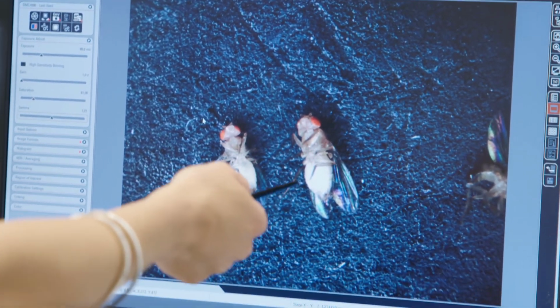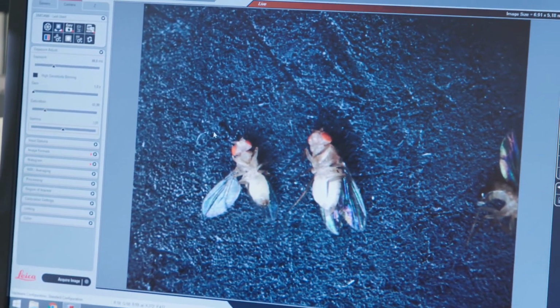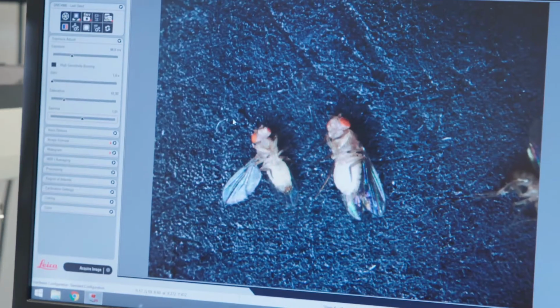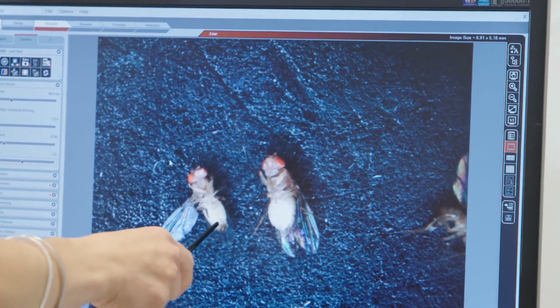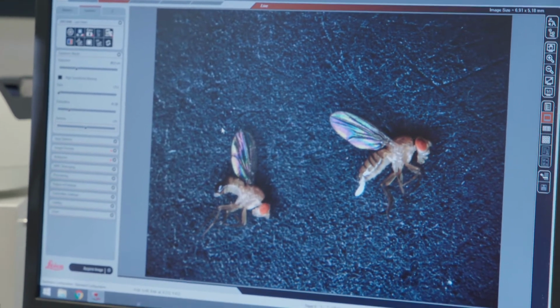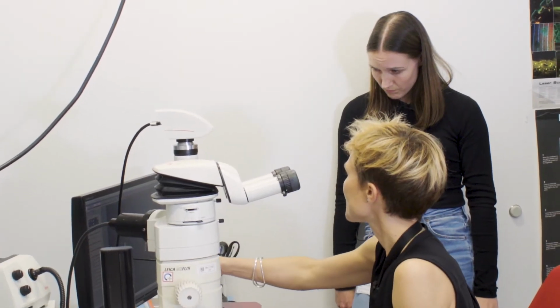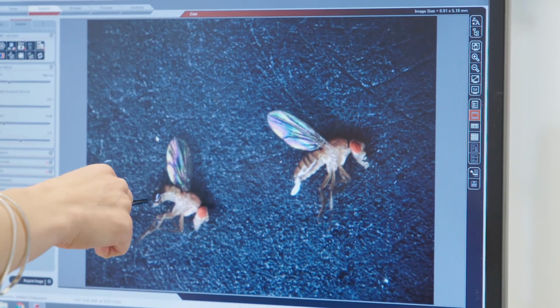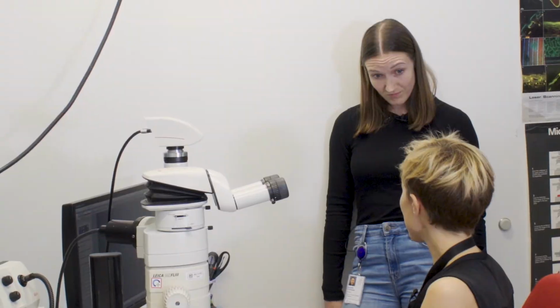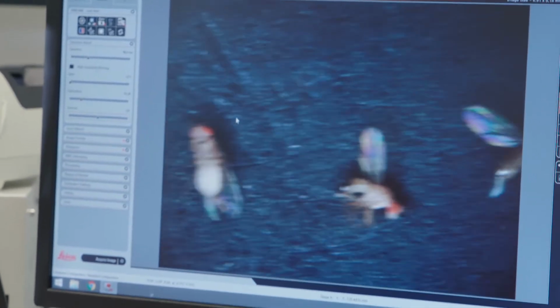You can see the female is already much larger. The reason we can see the difference between genders is the size. You can also see this black area here, and that's for the male. Here we've got adult flies, and you can see that the female is again larger, but there's no black posterior end, whereas here this is completely patterned. Half of this area is completely black, and just to confirm it's a female, it is also laying an egg. So that's males and females, and then the virgins.